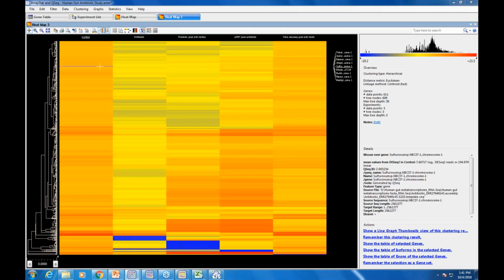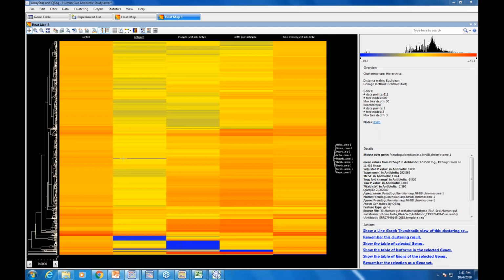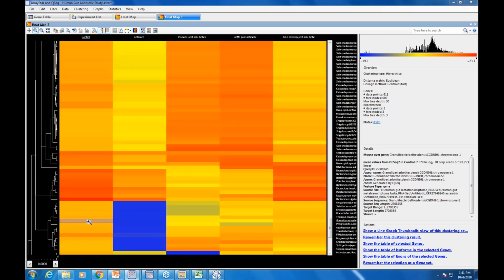So it's just those top ones that have enough signal in the control. And you can see that in the overall pattern, a lot of these are still at a low level, maybe some of the noise region, where we're getting some mapped reads. Down here at the bottom, you see very much some differential, and these are the higher expressed or the more abundant bacteria that were in the sample. And so control is the first column, and the darker red indicates more signal there, more aligned reads.